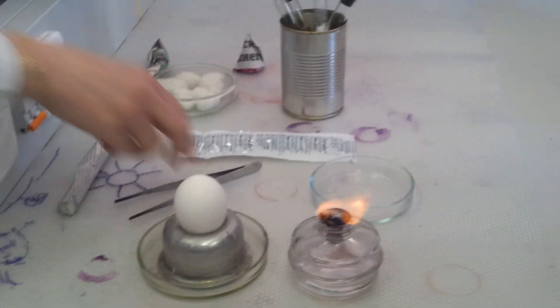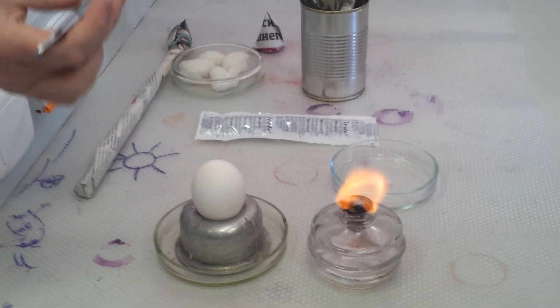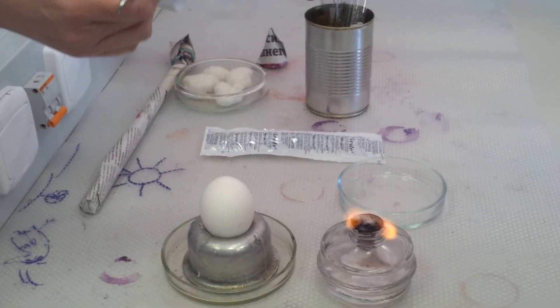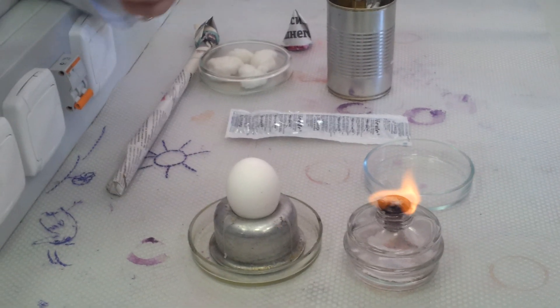We need the burner. First of all, we clear the zone where we work. This is the alcohol.